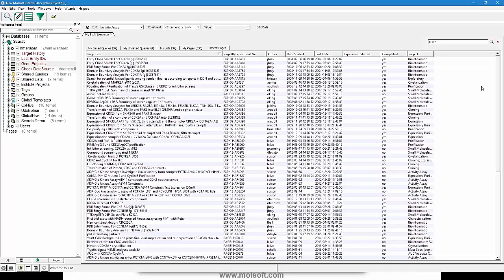Great. And the other question was, is it possible for the administrator to write a template for users to standardize their inputs? That's a great question, and I can't believe I didn't think of putting a slide in this. Absolutely. Any page can be converted into a template, and then that template can be cloned if it's a standard operating procedure, for example, and the missing gaps filled in. And in fact, a lot of people do that here at the SGC, and I'm sorry I didn't explain that in more depth. But yes, that's a critical aspect of this.